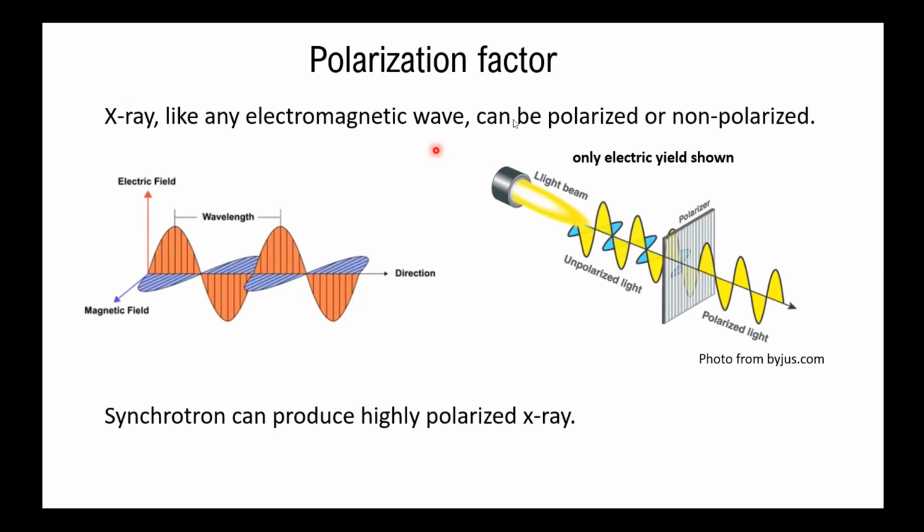So it can be either the gas or the solution, when it's polarized, and so it kind of filters out certain electromagnetic waves, such that we can only observe the electromagnetic wave in a specific direction, right? So this is polarized, and this is in the context of some kind of more like either the light from the lamp or natural light.